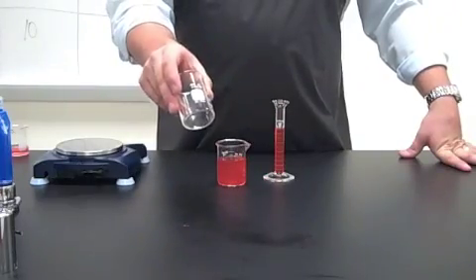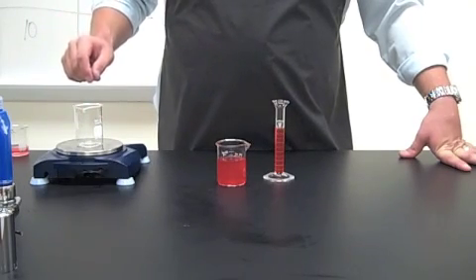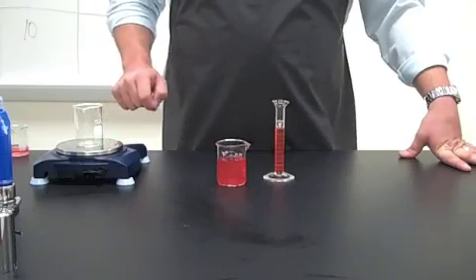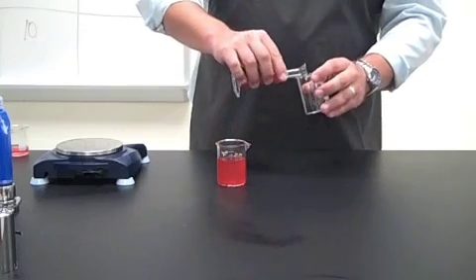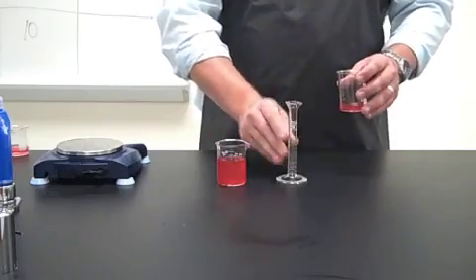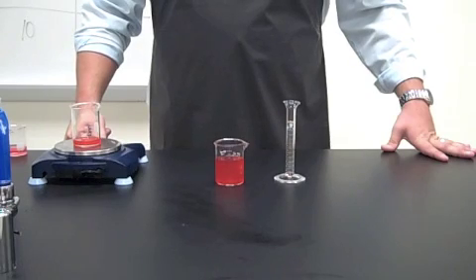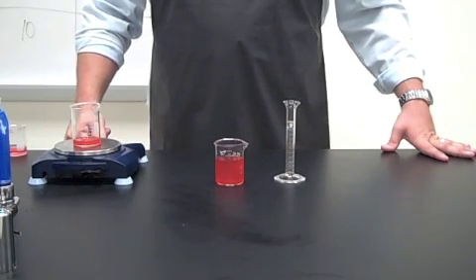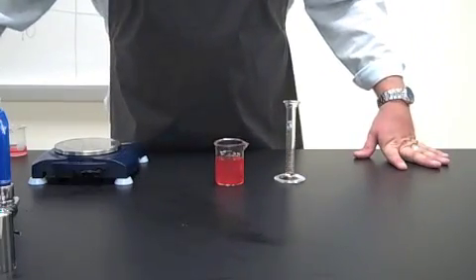Now we're going to take our 100 milliliter beaker, put it back on our balance, zero it out, and add our 10 milliliters of Hawaiian Punch. And now let's record the mass. And we see that the mass of the Hawaiian Punch was 10.21 grams. And guys, it's okay to pour it down the sink. Just put a little water behind it.